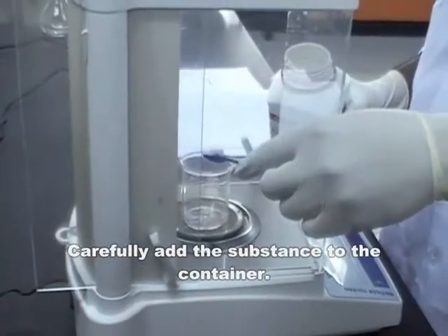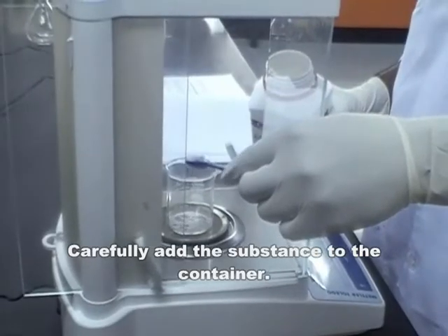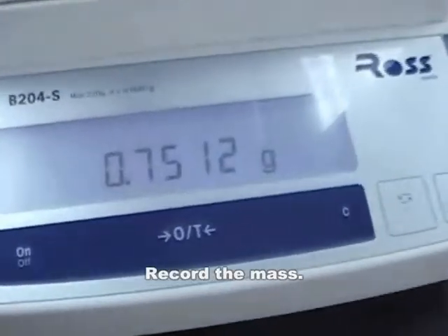Carefully add the substance to the container. Record the mass.